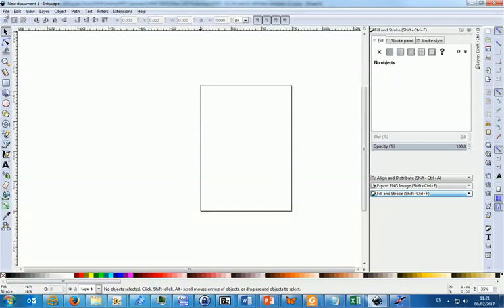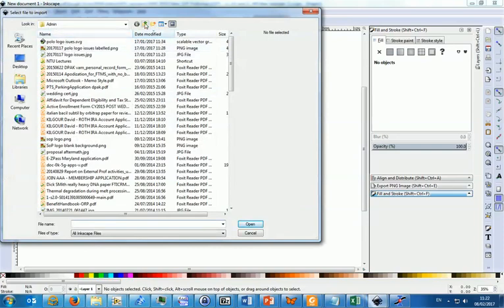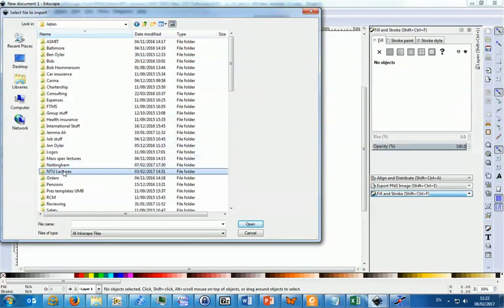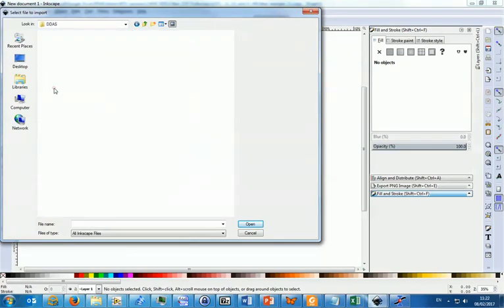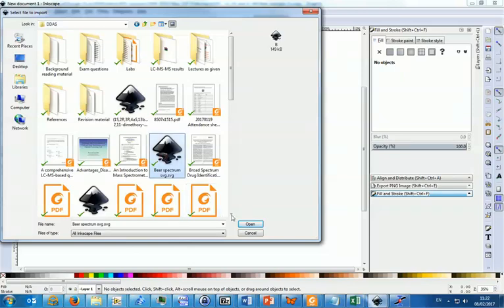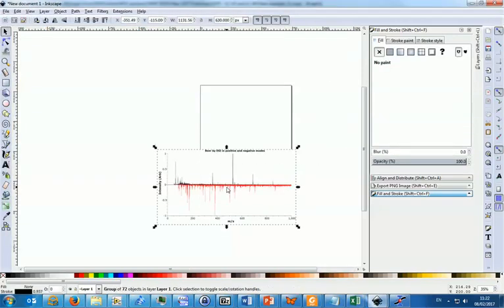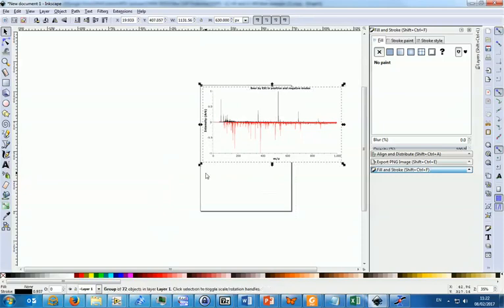Now Inkscape's open, you can import the SVG file of the spectrum you just saved. The first job is to rescale the graph so that it's the right size for fitting on an A4 page. We can do that very precisely in Inkscape, allowing us to make the figure exactly the right size for journals. In this case we're going to make the graphic 15.4 centimeters across.